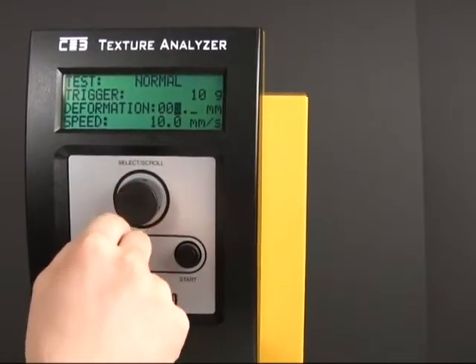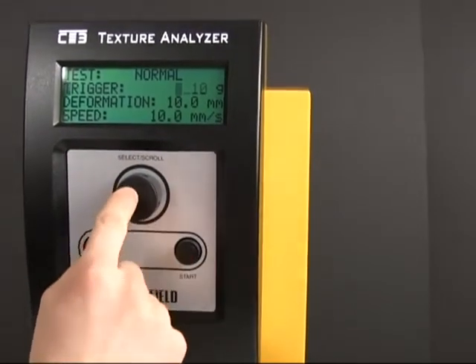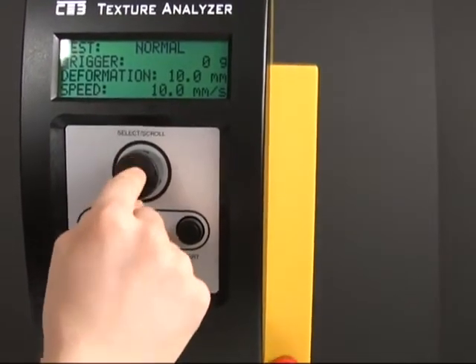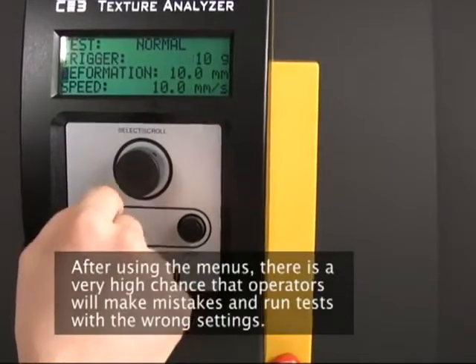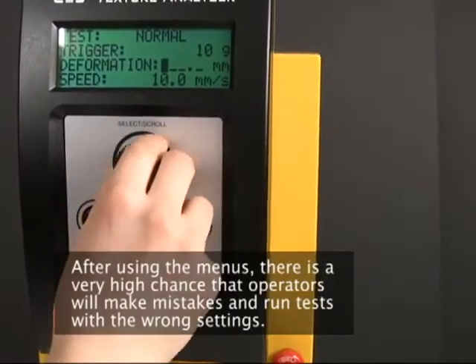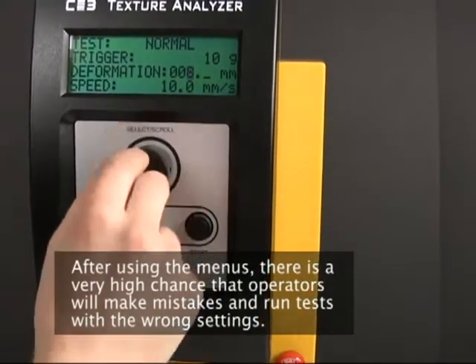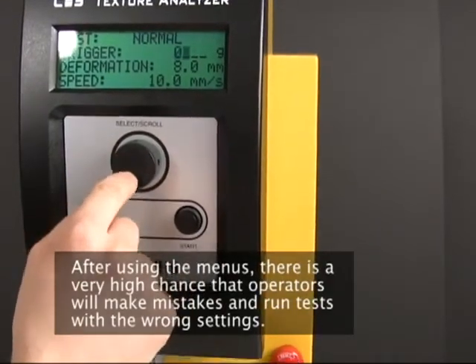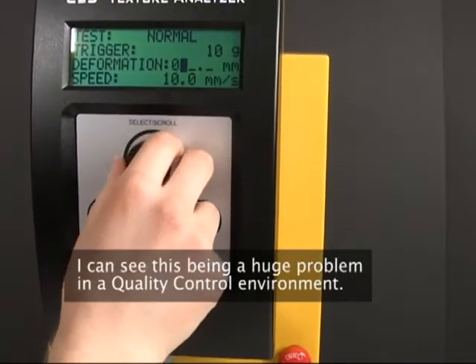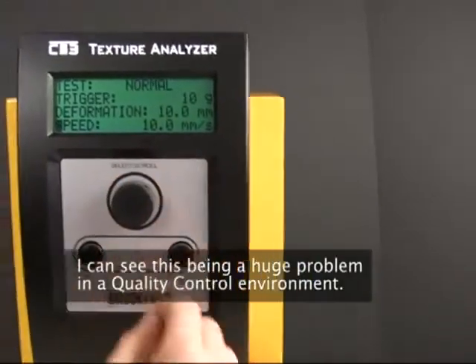I'm going to do 10 millimeters. Zero, zero — 10 gram trigger. Zero, zero. Speed — yeah, I'll just use 10 millimeters a second. I'm just going to use these little balls I've got sitting around, just little foam globes.